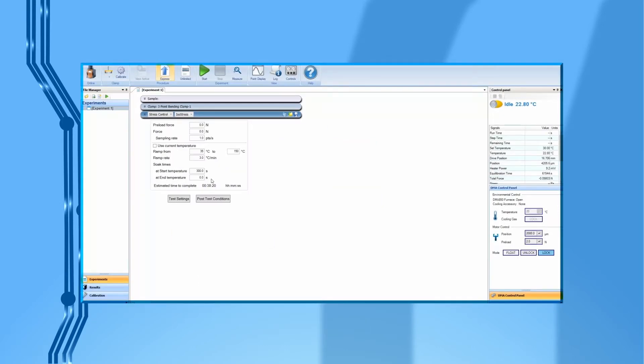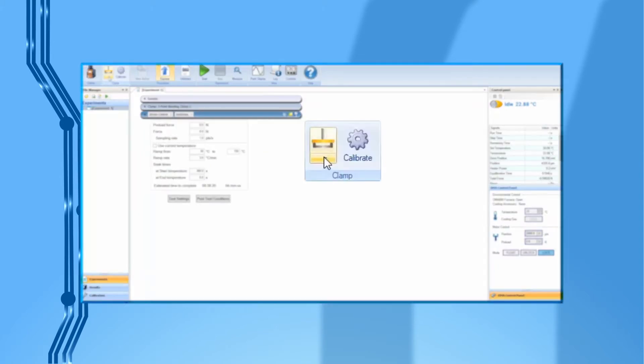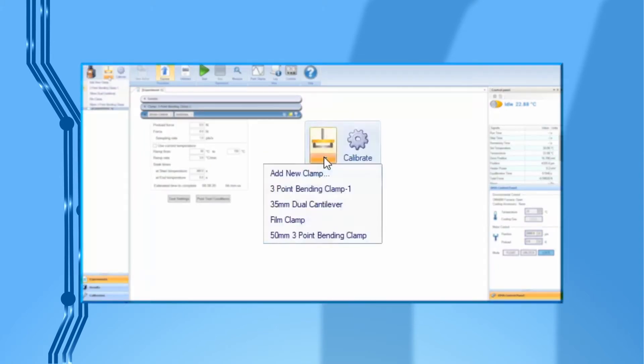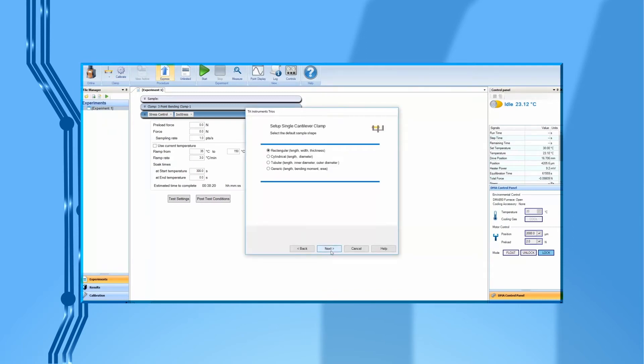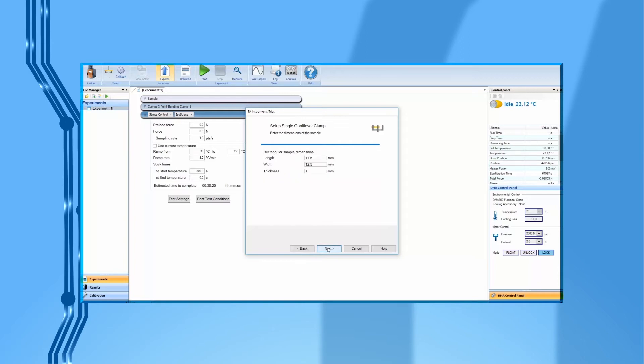If this clamp file has not been previously created, then click on Add New Clamp. Select Single Cantilever, then click on Next. In this page, select your sample geometry, for example, Rectangular, then click on Next again.